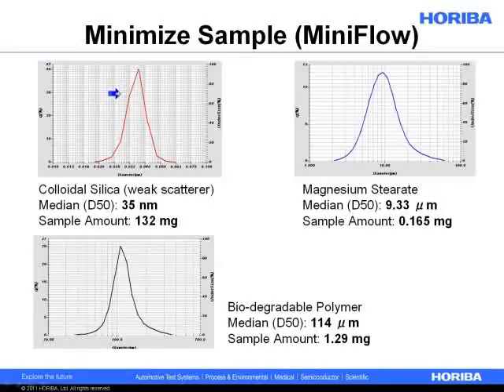Sometimes the design isn't updated, it's just the box covers. But if the design is being updated, that should be a central goal, is to make it easier to get a good measurement with less material. And in this case, again, this is data that I collected a few years ago on the LA950.